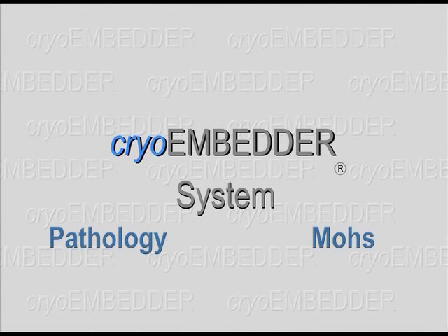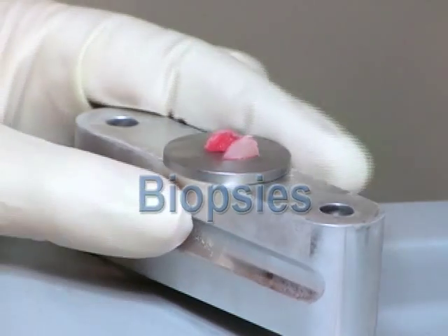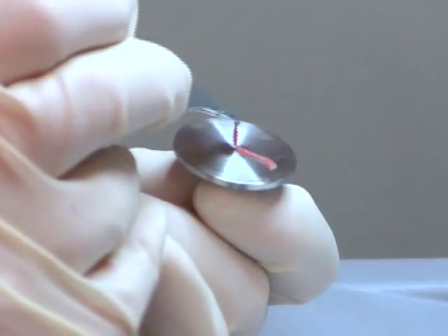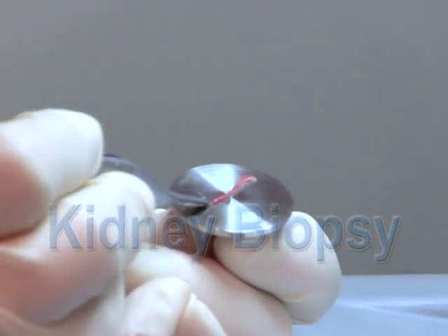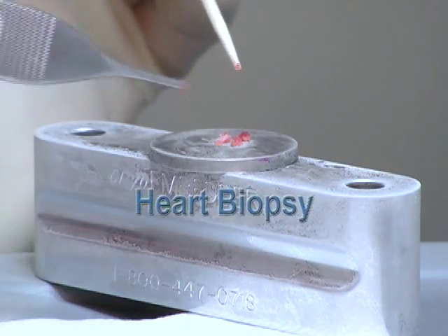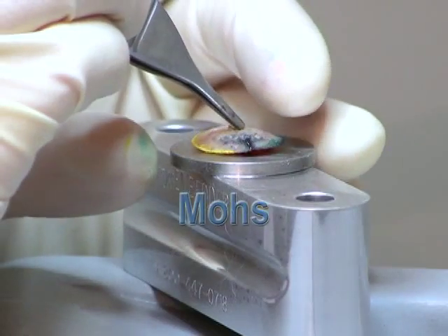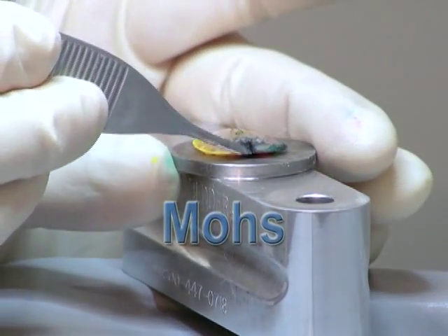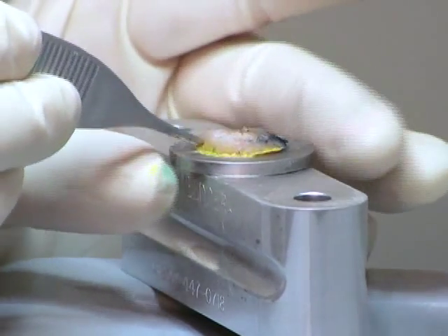This instructional video will be demonstrating the speed and accuracy of processing frozen tissue with the cryoembedder. The first part will be using a variety of tissue samples processed routinely in clinical pathology labs. Part 2 demonstrates its use when processing frozen sections on skin cancer removed during Mohs surgery. Part 1 is shown in actual time; Part 2 is demonstrated slower for teaching purposes.